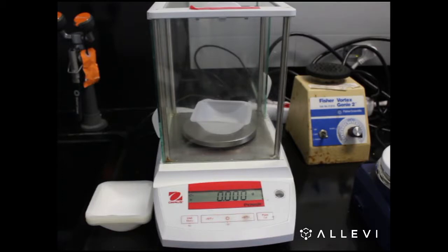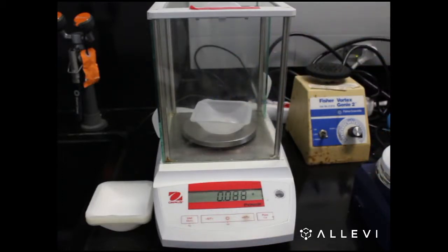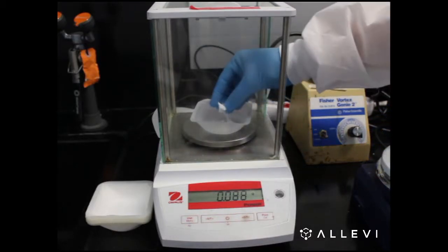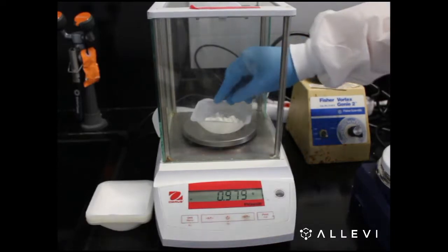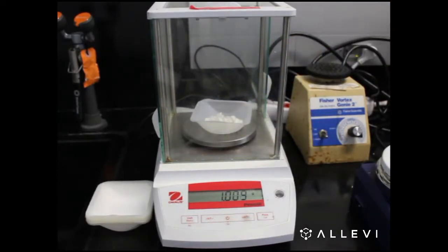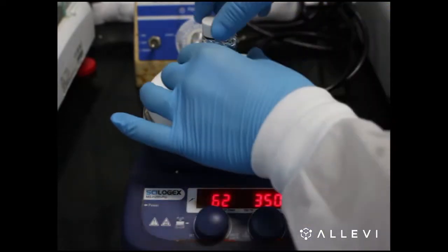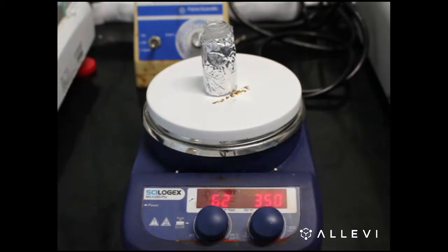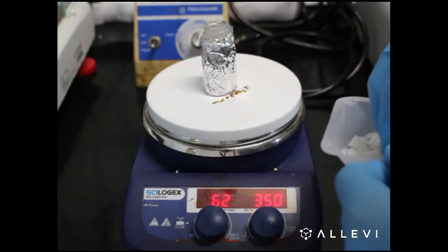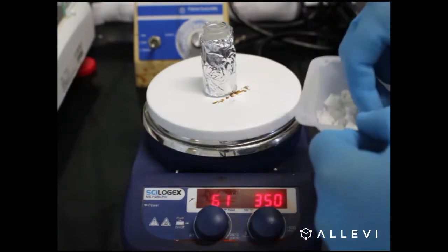In a weigh tray, measure out 1 gram of GelMA. Next, add the GelMA to the LAP solution. Make sure all the GelMA is in contact with the LAP solution, replace the cap, and allow it to dissolve for 2 hours. You can increase the speed for improved mixing.